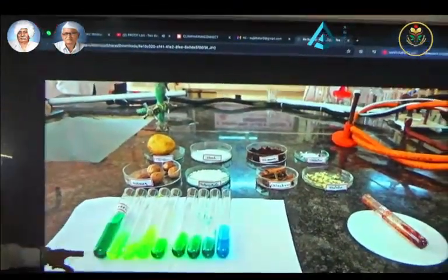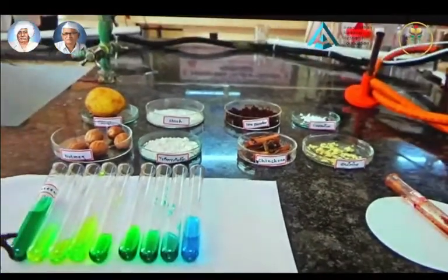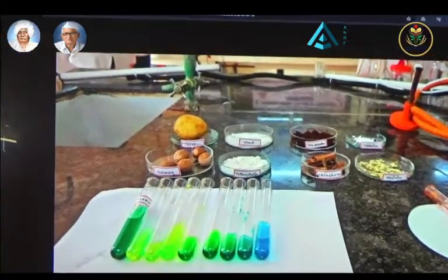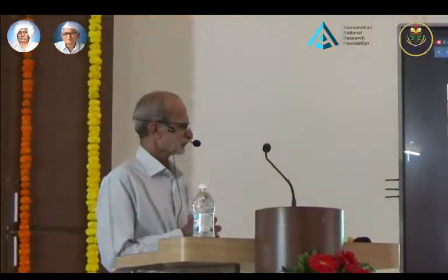Here you can see the separation of dye. So this was the green color originally used. Yellow got separated, then greenish, and then of course blue. Okay, so those were some five to six experiments demonstrating separation, TLC, and column chromatography from herbals to phytochemicals.